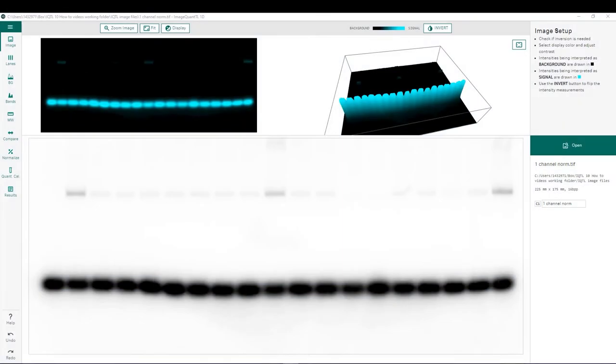In this ImageQuantIO version 10 tutorial video, we will be looking at band intensity comparisons with normalization to a loading control within a single channel.